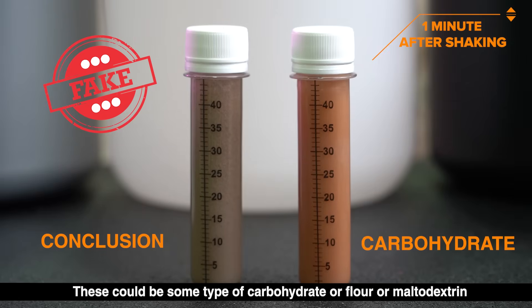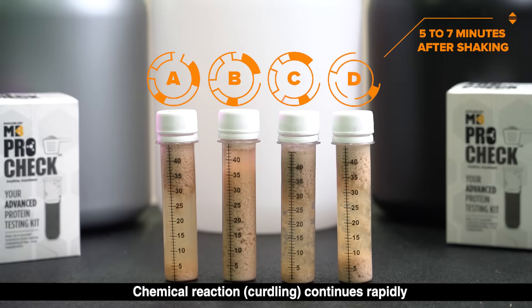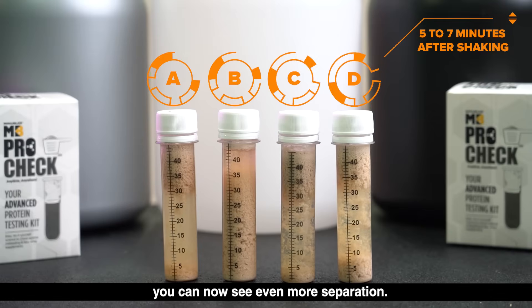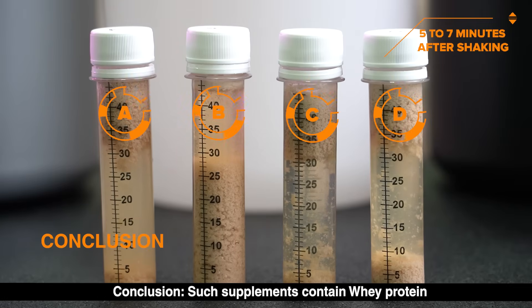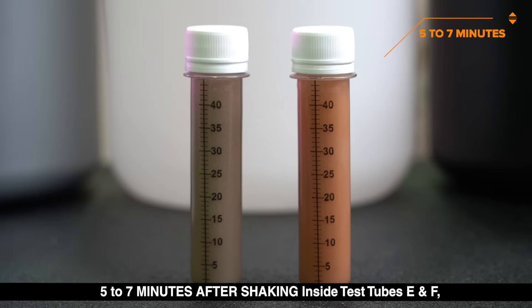Five to seven minutes after shaking, inside test tubes A, B, C, and D, the chemical reaction — curdling — continues rapidly. You can now see even more separation. The precipitate starts settling at the base of the tube as a coagulate. Conclusion: such supplements contain whey protein.